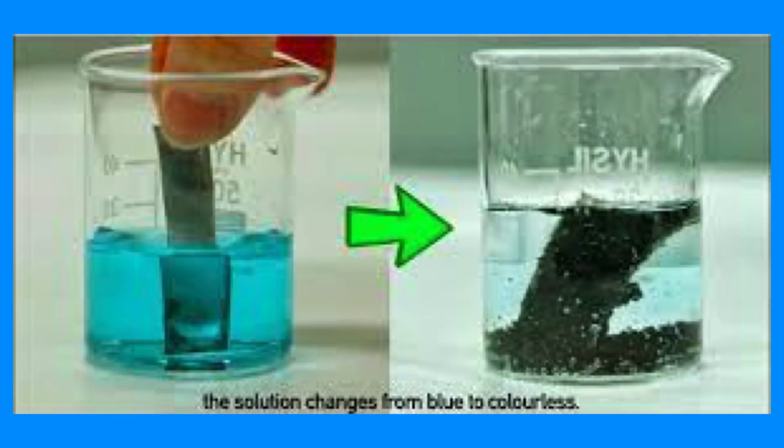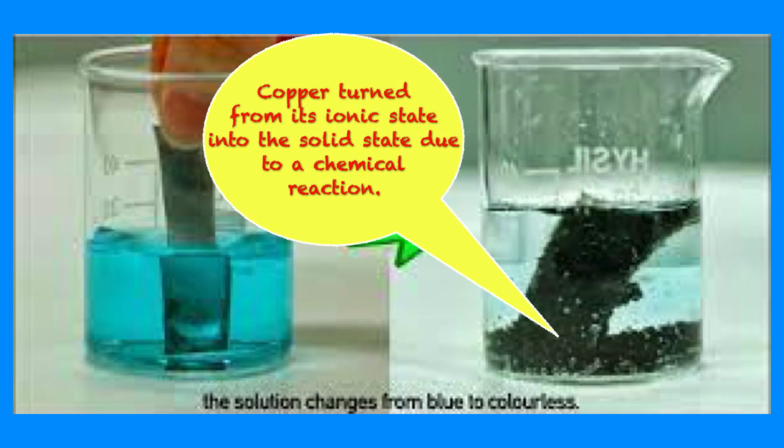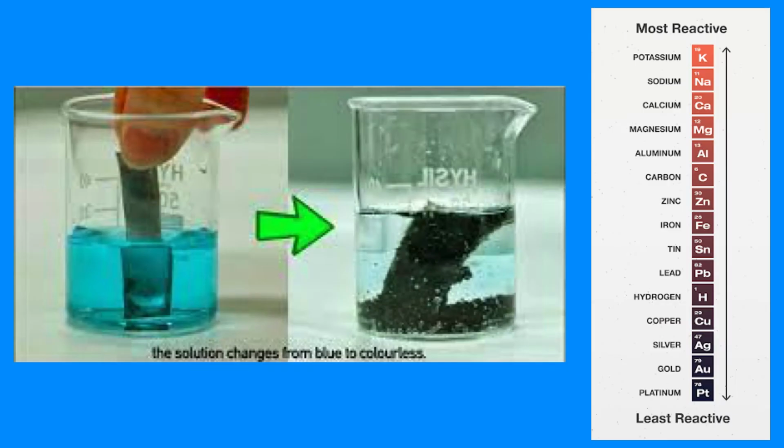What happened to the copper ions which were dissolved in the solution? Here, copper turned from its ionic state into a solid state due to a chemical reaction. Great. Now, compare the reactivity of zinc to the reactivity of copper. Zinc is more reactive than copper.